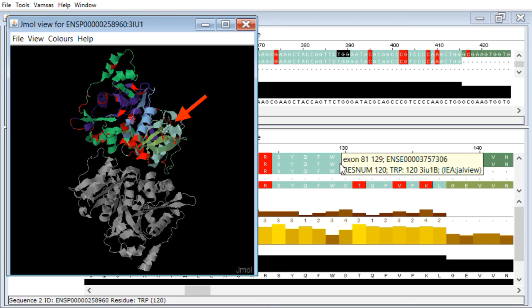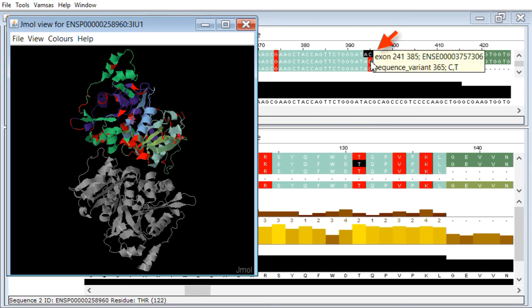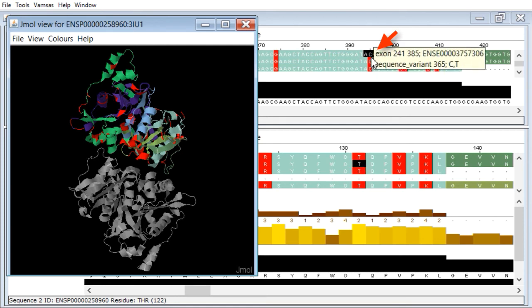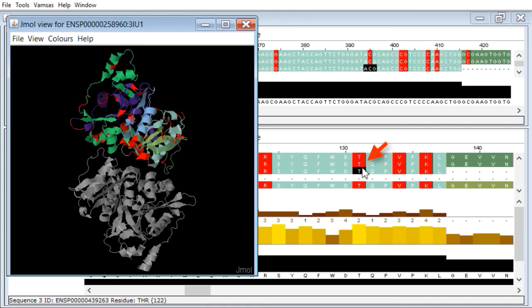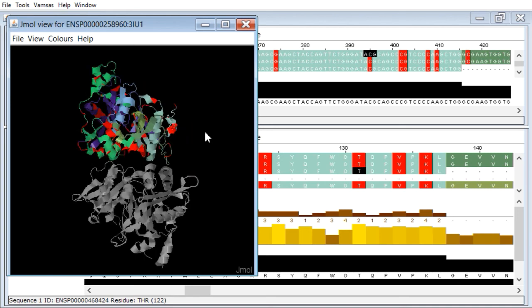So we can go directly from that variant and we can see what that variant is. C to T variant through. You can see what the exon is. It maps on exactly. So you can see that's going to be an ACG to ATG. So threonine to methionine variant. And you can see exactly where that's popping up on the protein structure here. There we go. Just there, that threonine there.